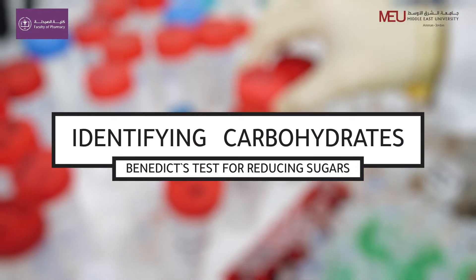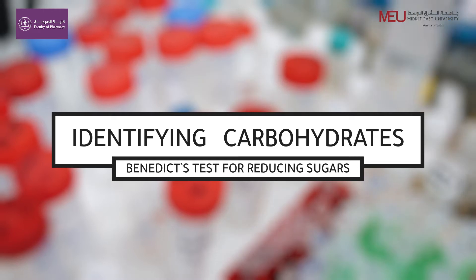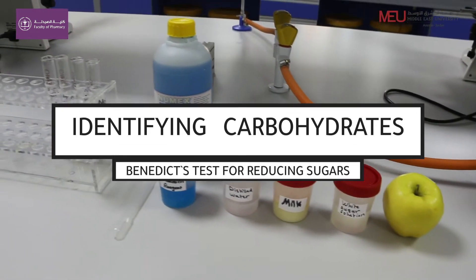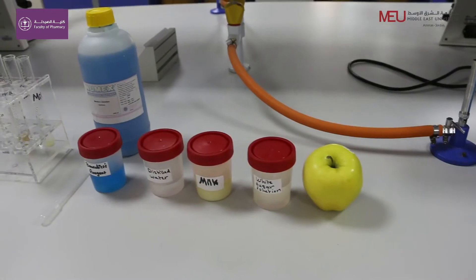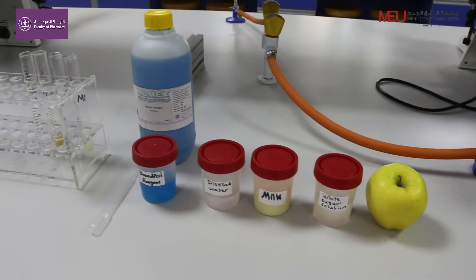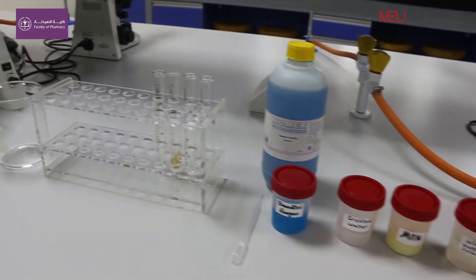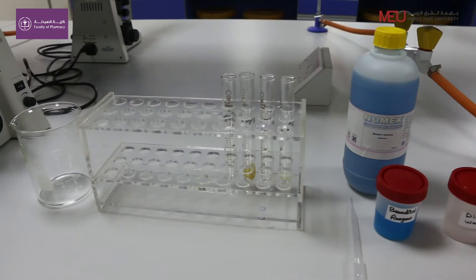Identifying Carbohydrates. Benedict test for reducing sugars. A commonly used test to detect carbohydrates is the Benedict test for reducing sugars such as glucose and fructose.